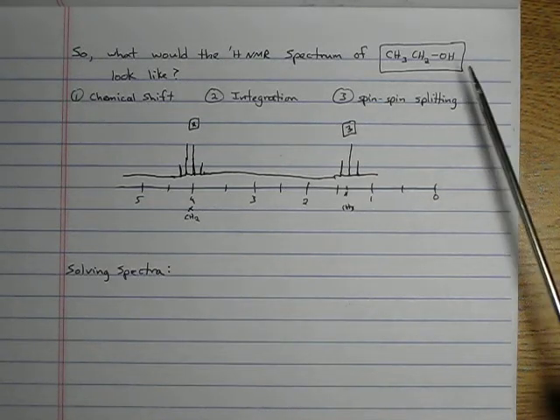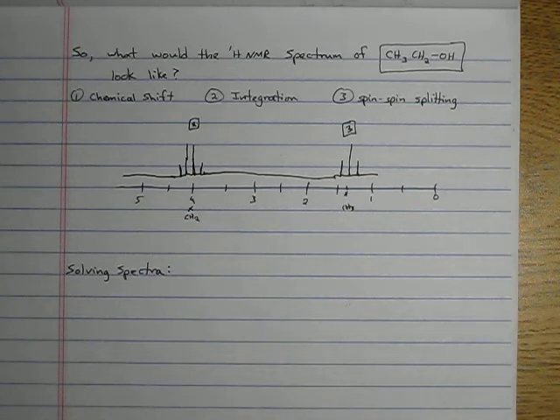Where is this hydrogen, this OH hydrogen? Well, a few things. One, what about the chemical shift of hydrogens on oxygen or nitrogen? That's right, it can be anywhere. It can be anywhere in here. So let's just give it a value. Let's get it away from everything. Let's say that comes at about 2 ppm. All right, sounds good, 2 ppm. Could be anywhere.